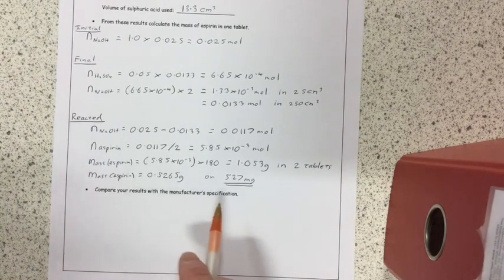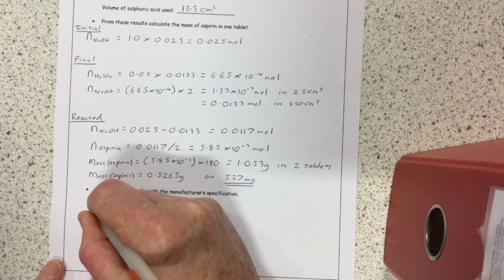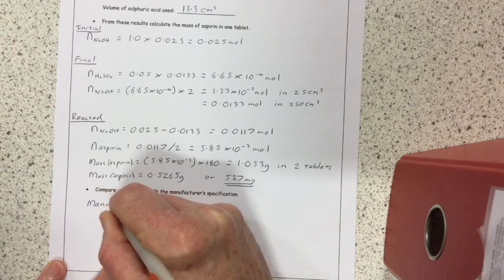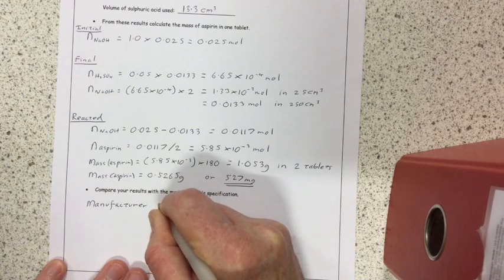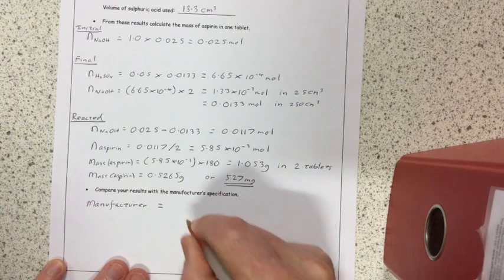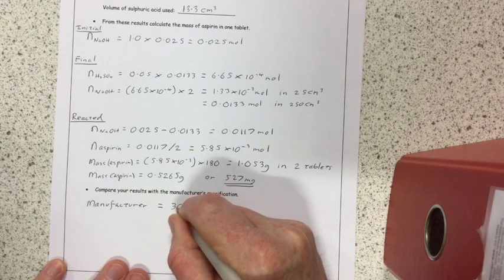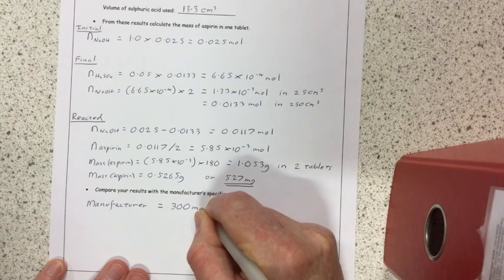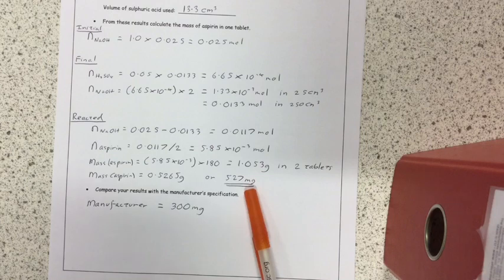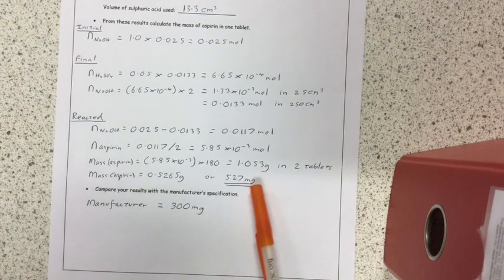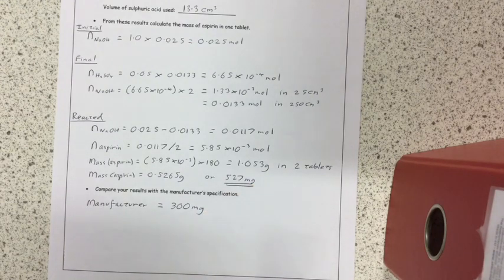Okay, finally it says, compare your results with the manufacturer's specification. Well, according to the manufacturer, the mass of aspirin in one tablet was in fact only 300 milligrams. So, we had a far higher number than, or at least I had a far higher number than we should have got.